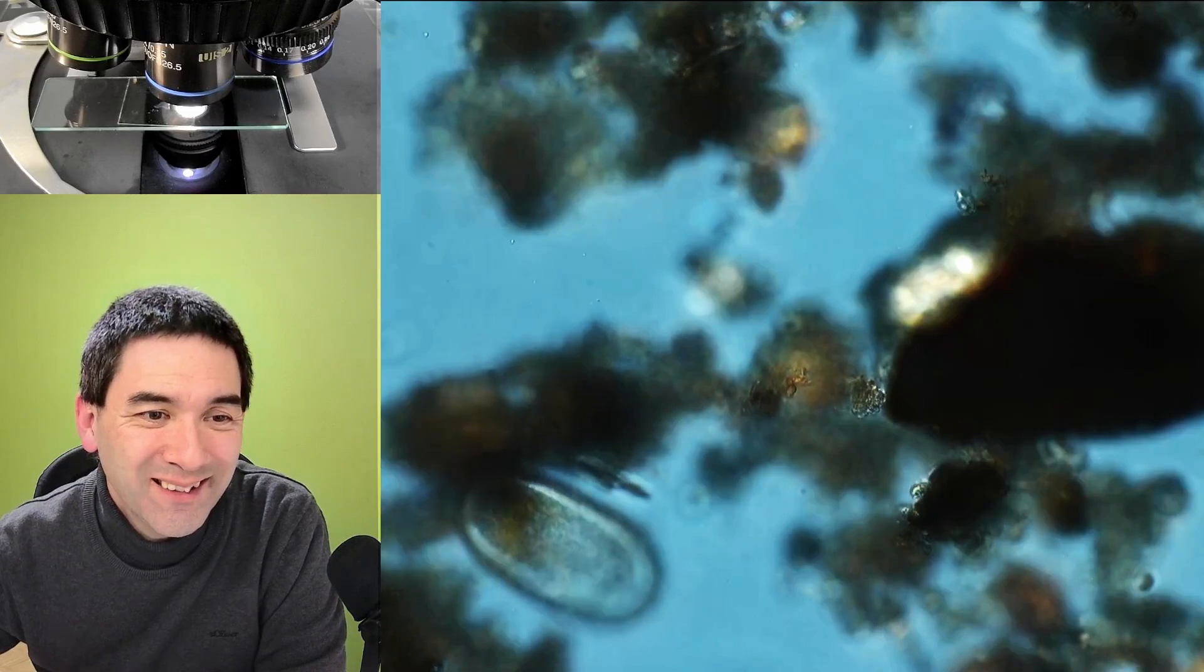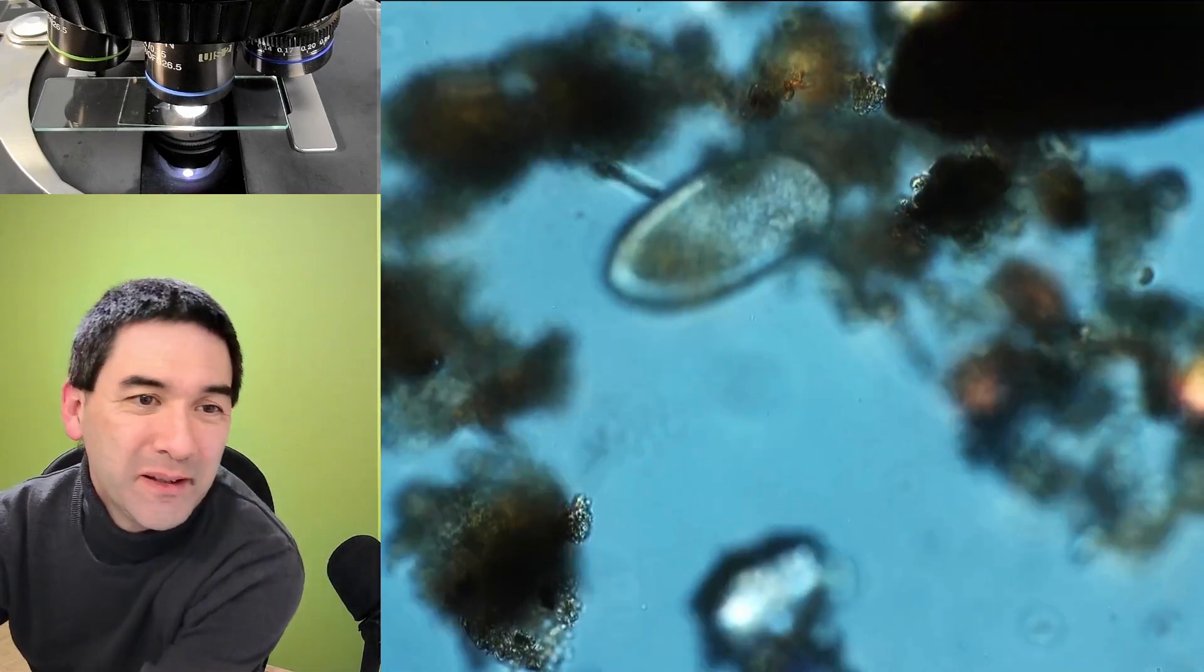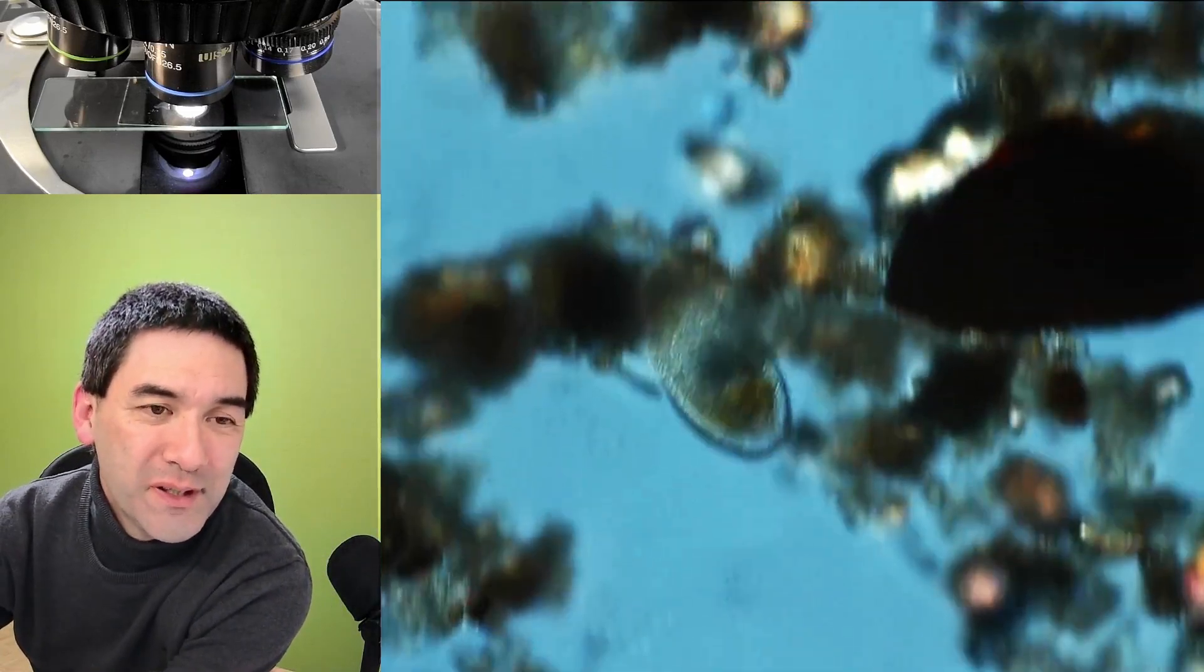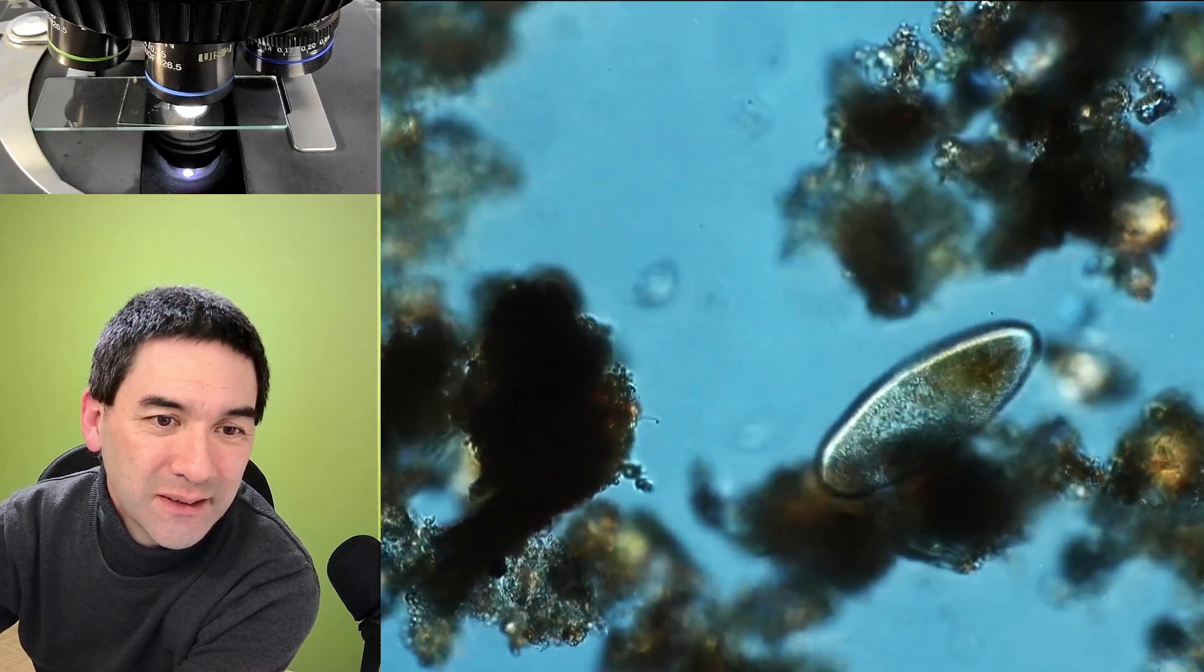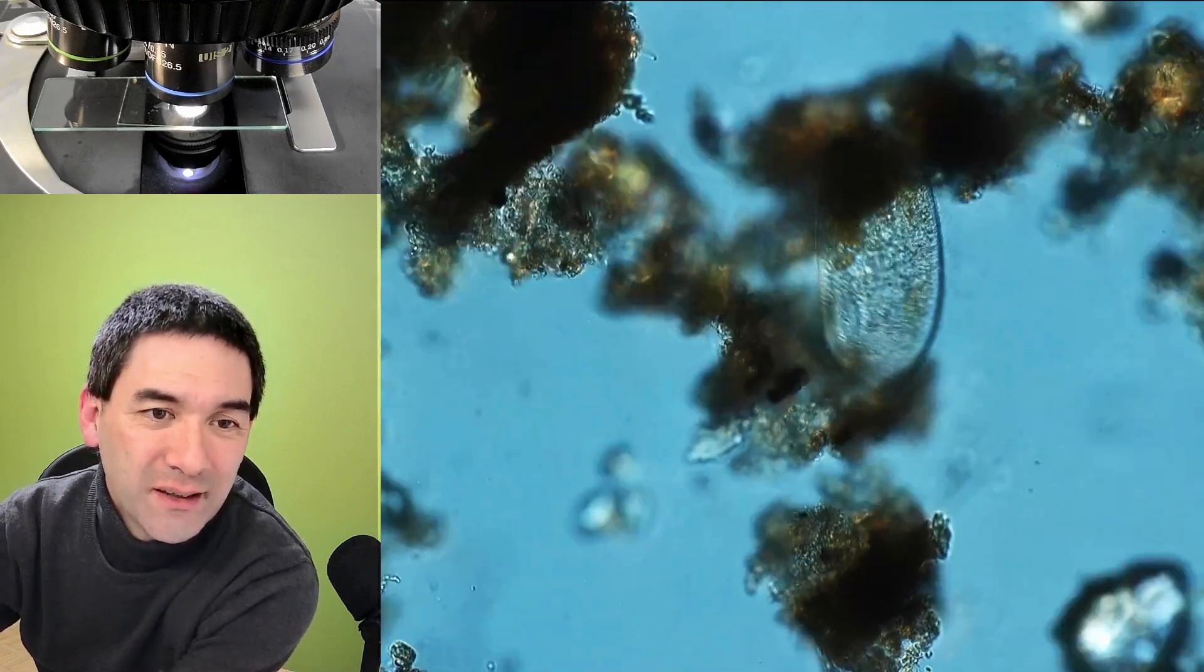And now we've got two of them, it's a little bit out of focus. So that's a nice ciliate here.